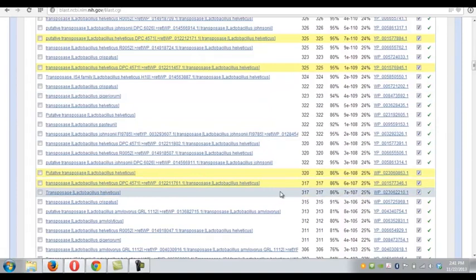And I want to caution you about that because the nature of the second iteration is very different from the nature of the first iteration. In the first iteration, we started with a transposase sequence from Pyrococcus. And when I ran that first iteration, I said that anything with an E-value of less than 1 times 10 to the minus 4th is a homolog. So now I see E-values much, much less than 1 times 10 to the minus 4th.